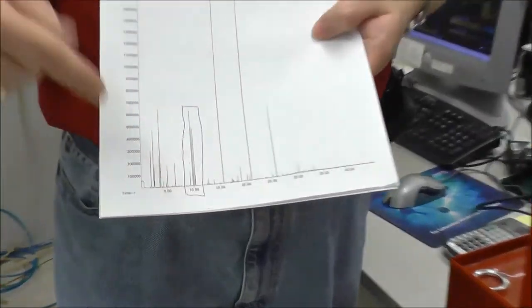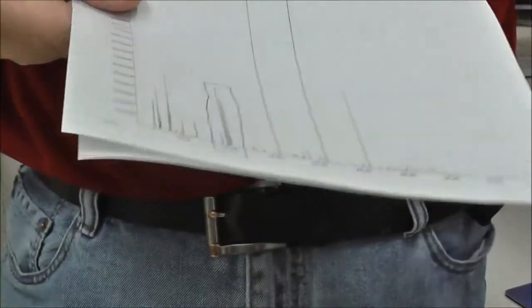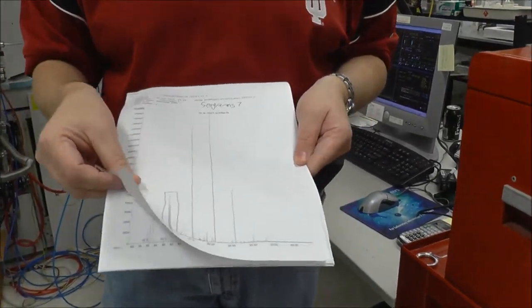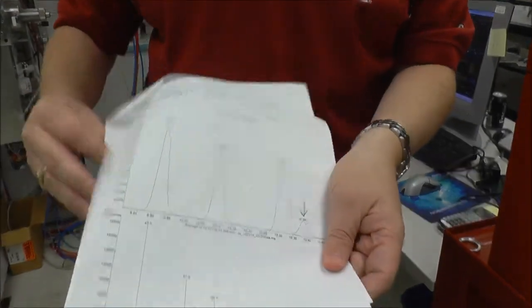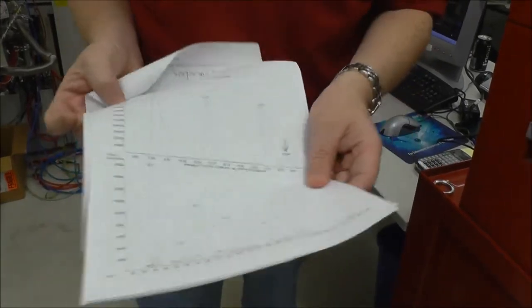Each one of these peaks corresponds to one of the components, the flavor-filled components that maybe make it taste good or give you the brown color. The ethanol's way back here, gets you drunk. If I blow up and look at that little guy right there, we go right here, we start with these four peaks here. We zoom in on the one at 10.8 minutes.